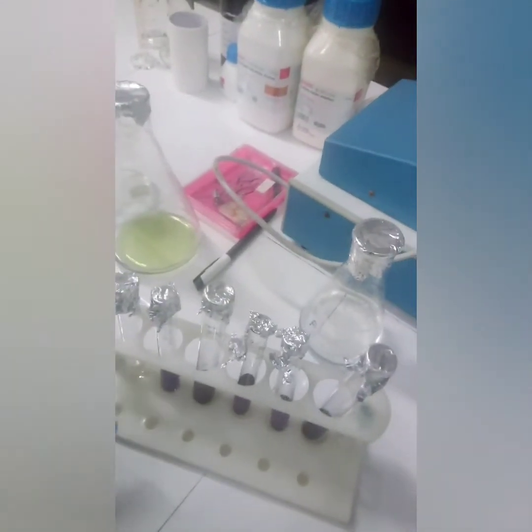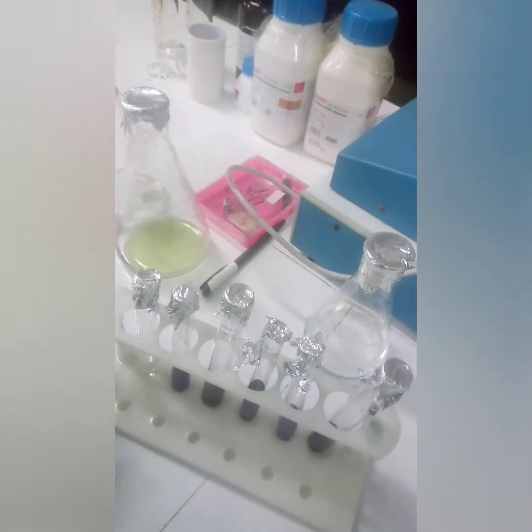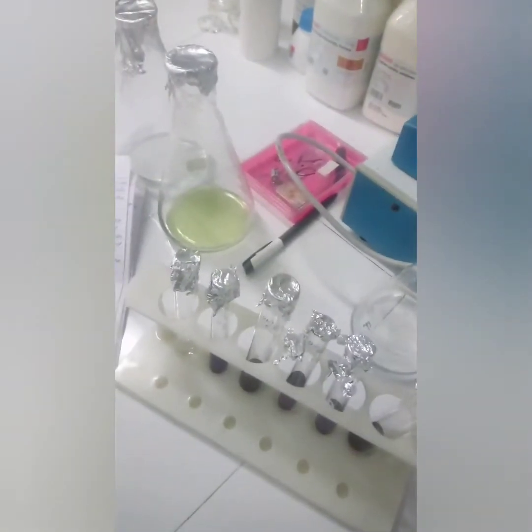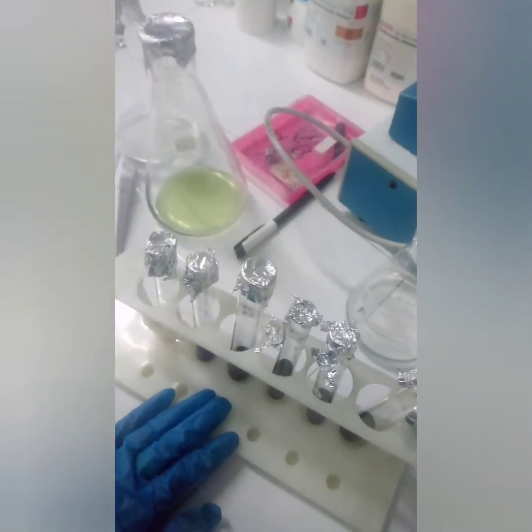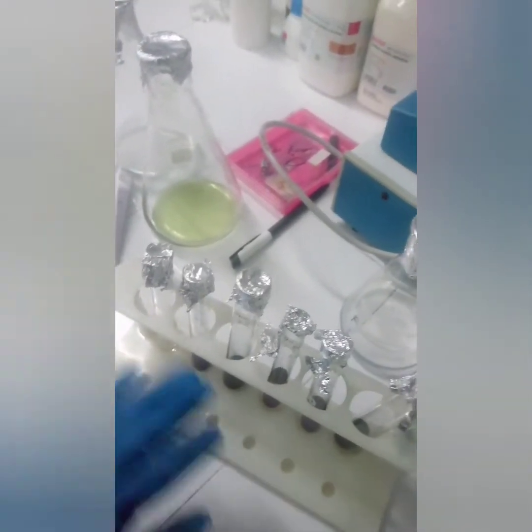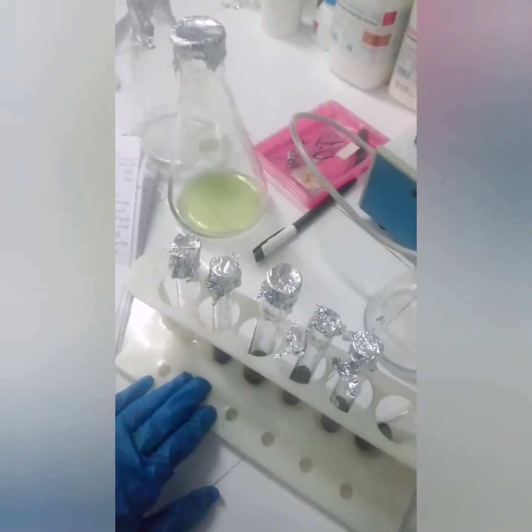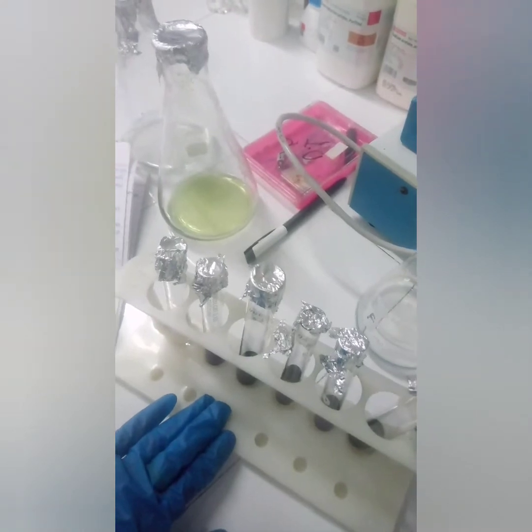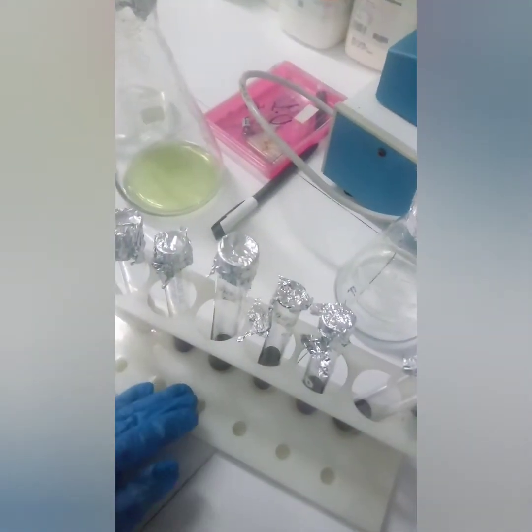This method of preparing the standard curve using Ninhydrin is one of the best methods for detecting amino acids. This experiment has been used conventionally to detect microgram amounts of amino acid.